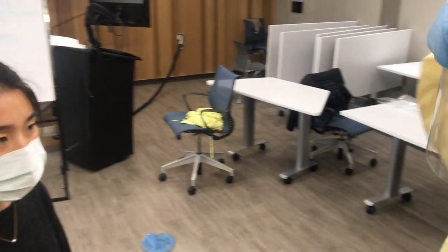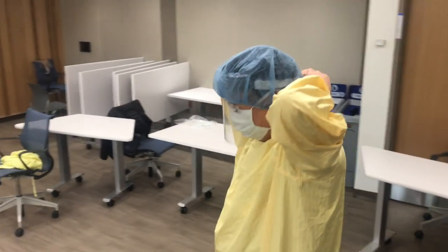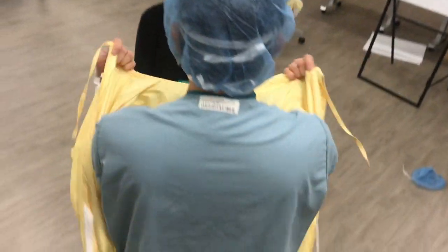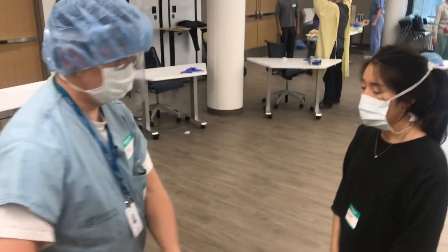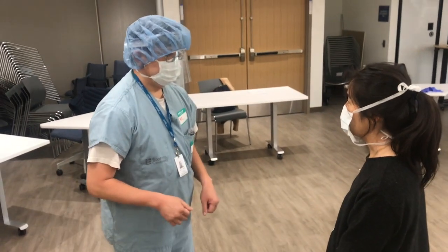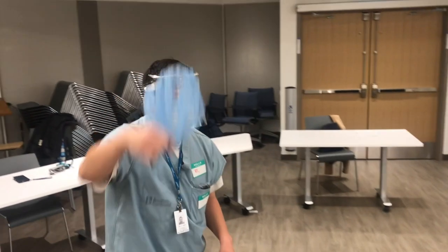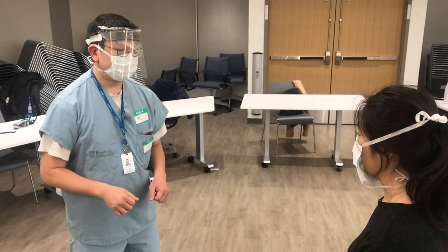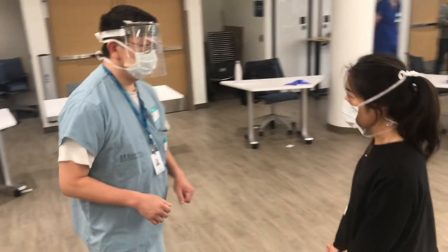You'll see there's a cue here to keep eye contact with the doffer, so Ginny is directing her doffer to do that while removing the gown, because there's a real tendency to slump the chin onto the chest when that's happening. So that was the COVID scrub indicated by the clap there. Proceeding to remove the bouffant carefully. Another COVID scrub indicated by a clap. And so throughout this, you can actually hear Ginny saying Simon Says.